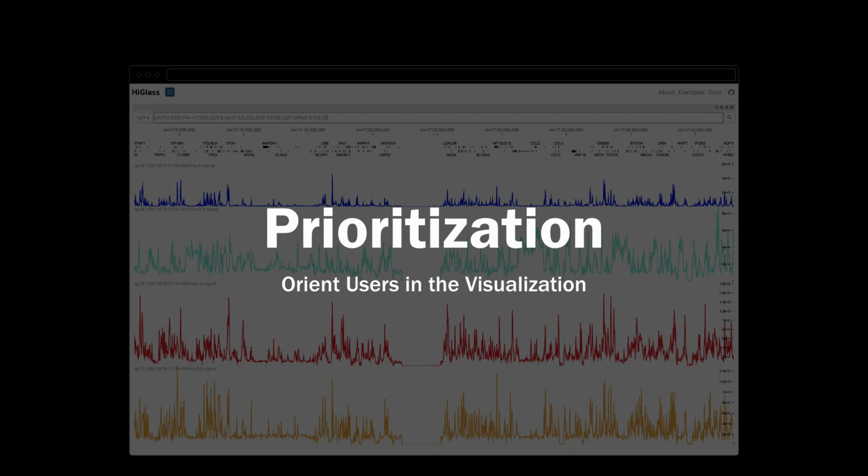Now, one thing about navigating genomes, as I pointed out, is that there are not a lot of landmarks. Although you could argue that genes, for example, are landmarks. And a lot of people are familiar with at least a set of genes that they work on or that they analyze. And that's something we can actually incorporate in a genome browser like this. So it's obvious that when you have a whole genome with some 25,000 genes, which is obviously only a very small fraction of the annotations in the genome, you cannot plot all the gene labels. But which labels should you plot?